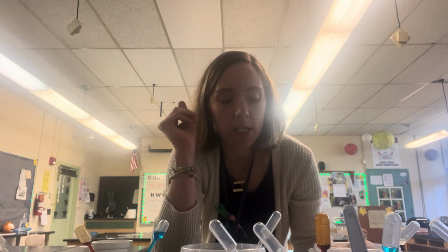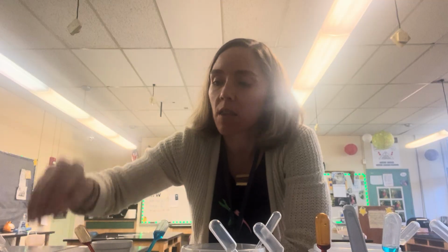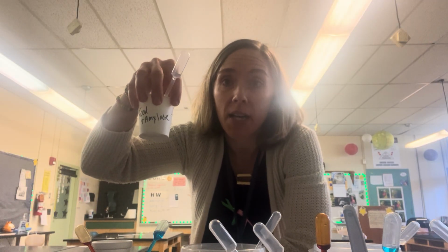We're doing an investigation to see how the food by itself is different in terms of the molecules it has in it compared to the food that has been exposed to the amylase. So in the lab, we had our 4 microcentrifuge tubes. We labeled them A, B, C, and D. A and B received liquid that was just the food. It was just the rice and water. C and D had liquid that was the food plus amylase. We wanted to see how the food reacted to the amylase.